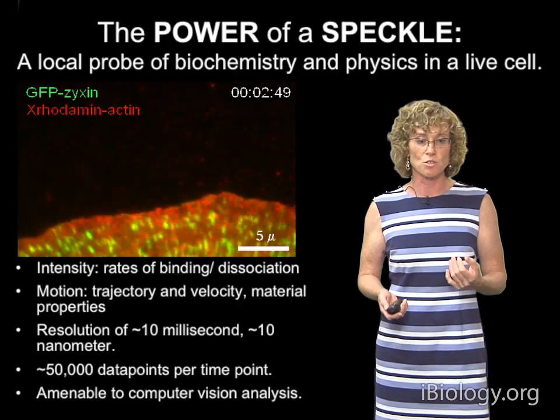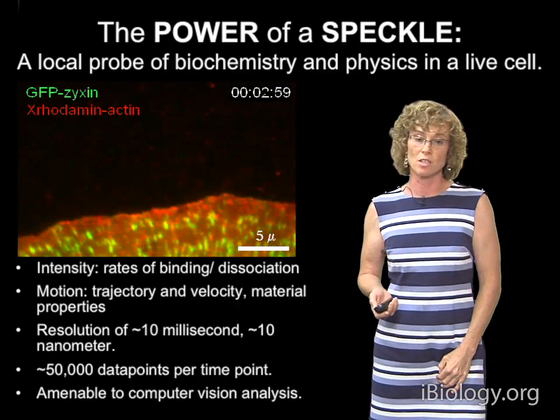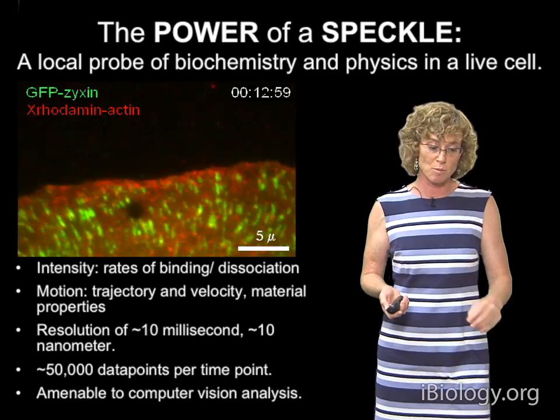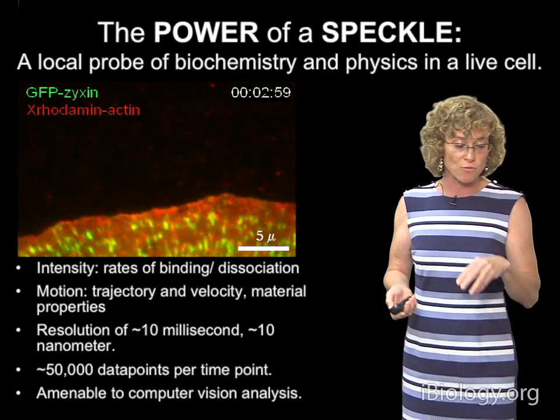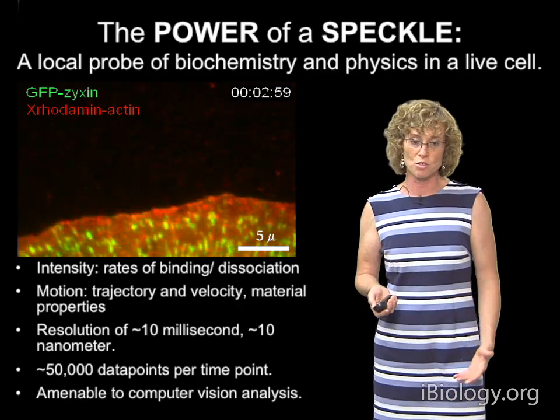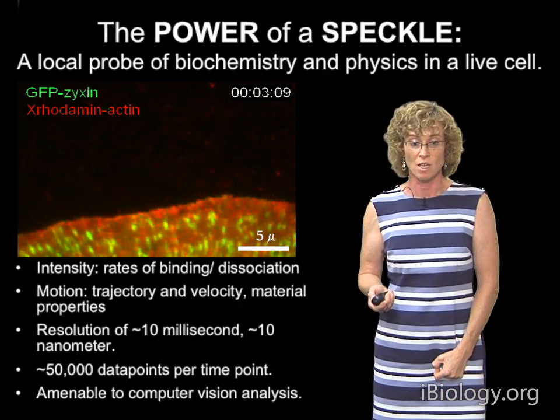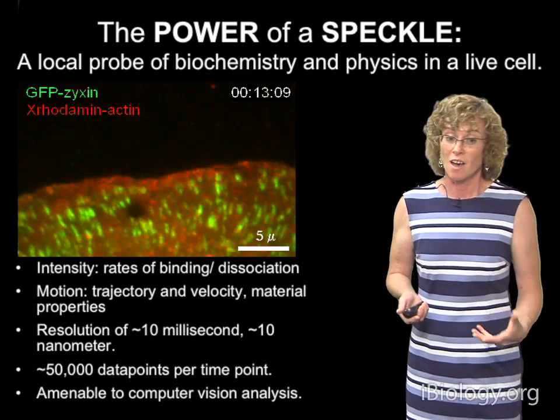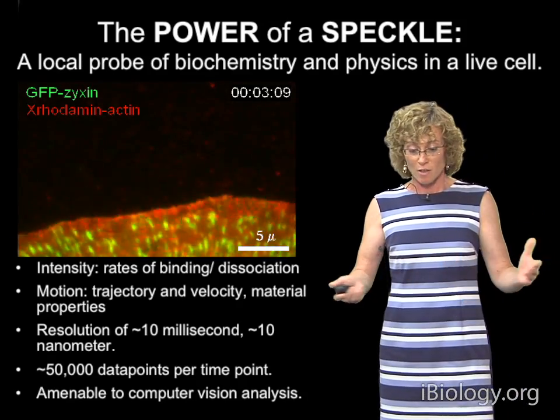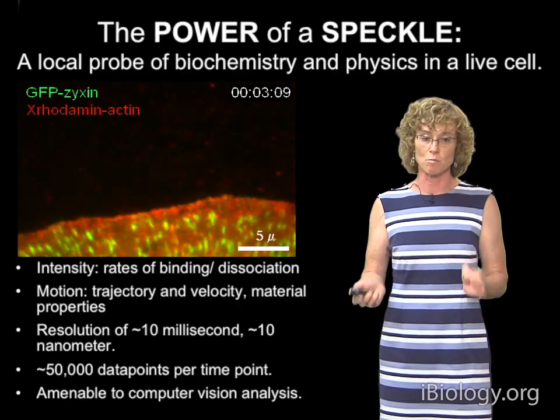It's a very high resolution method. The spatial resolution is on the order of 10 nanometers when you use point spread function fitting software, and the temporal resolution with EMCCD cameras today is on the order of 10 milliseconds. So in a movie like this, you've got literally millions of speckles that are sparkling and moving.